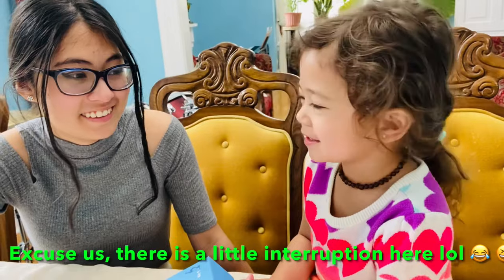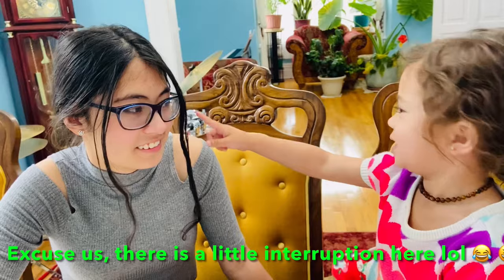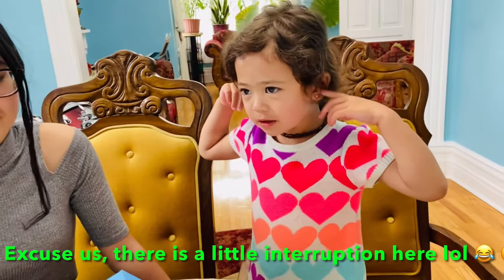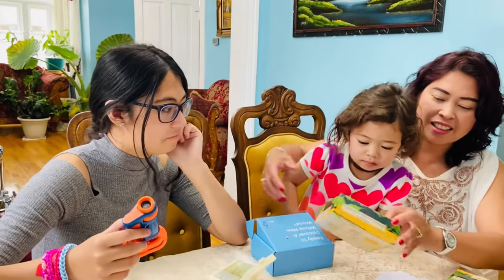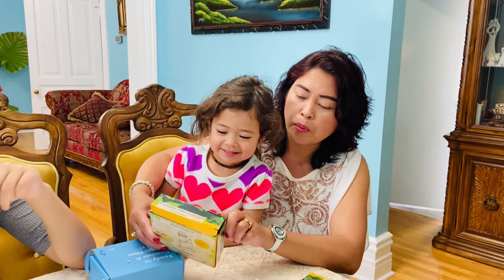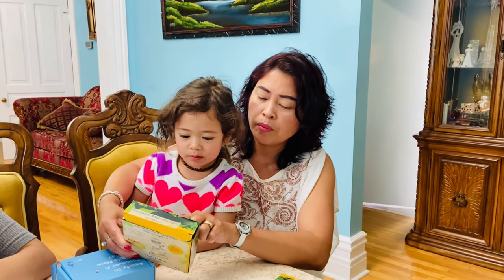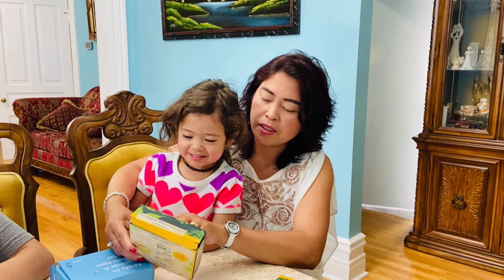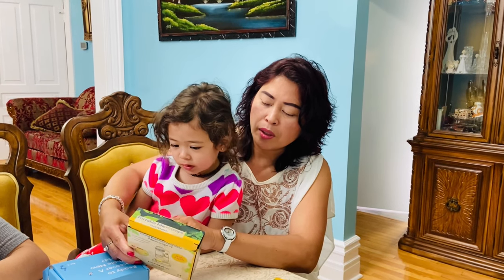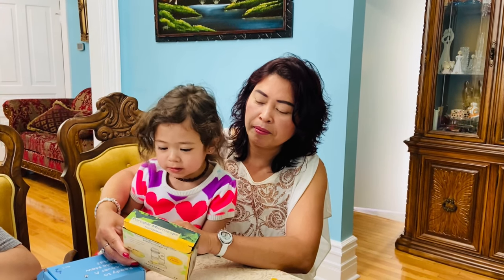It's funny, guys — it's nice and easy! Can you read this one? 'Portable microscope.' That's right! The magnification is 20 to 40x. And this here shows the age — it's 8 plus.